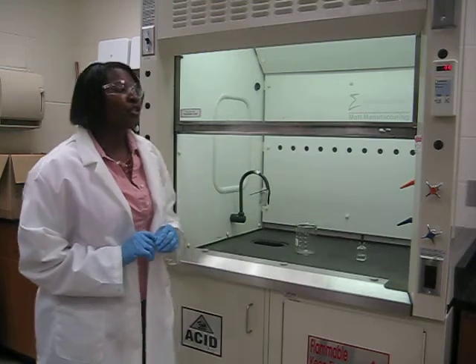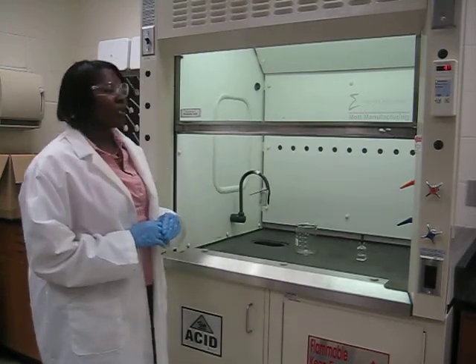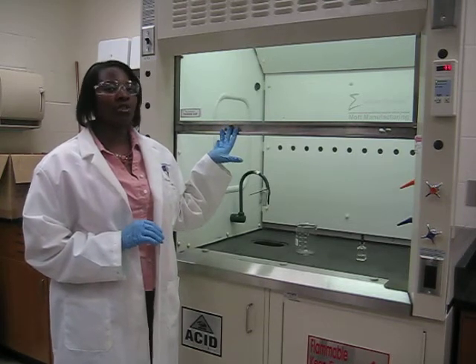Also, make sure that you check your status lights to make sure that everything is working properly. When using the fume hood, keep the sash open to only 16 to 18 inches to ensure proper operation of the hood.